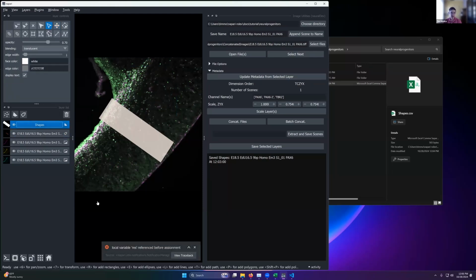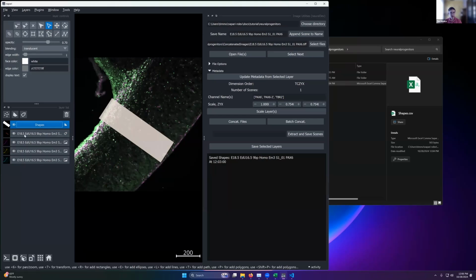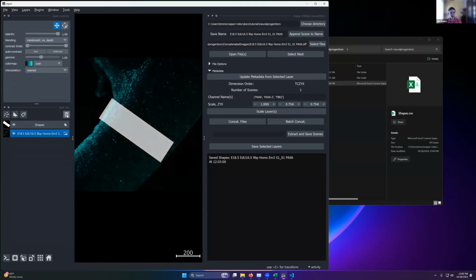If you see that bug, list index out of range, local variable res, again, that's going to be fixed in the next version of Napari. They just made some changes to the shapes layer that are a little funny right now. And so we're going to just delete these.